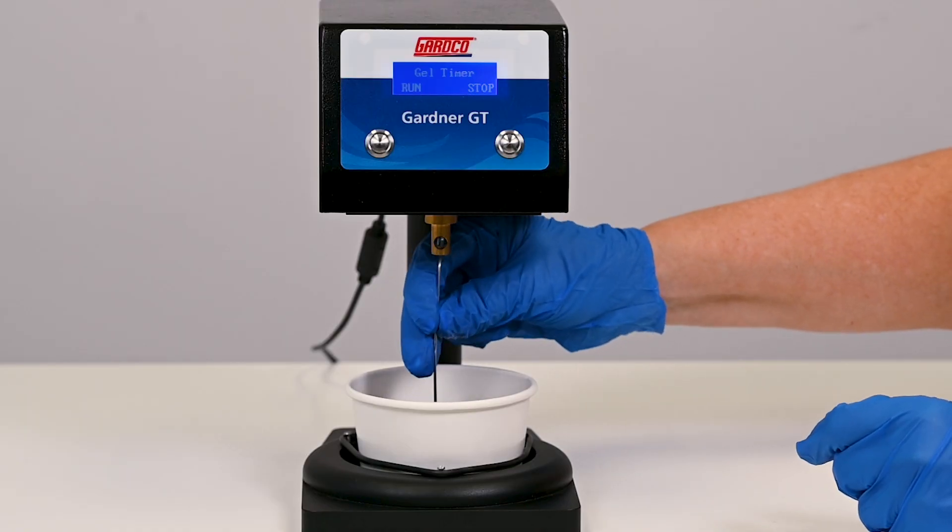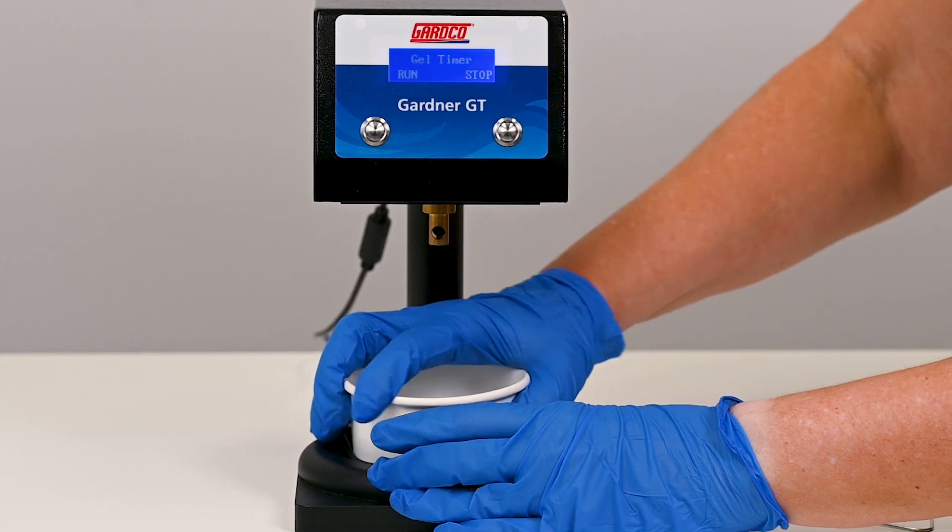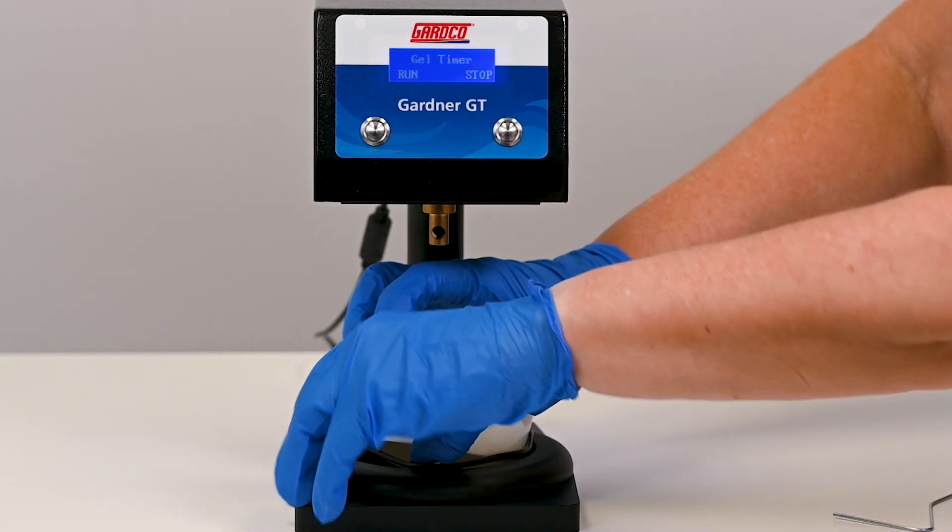Remove the stirrer and paper cup from the gel timer. Discard these in the proper waste areas.